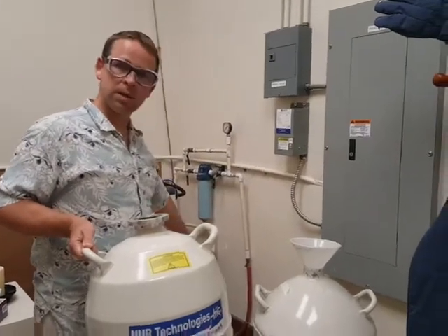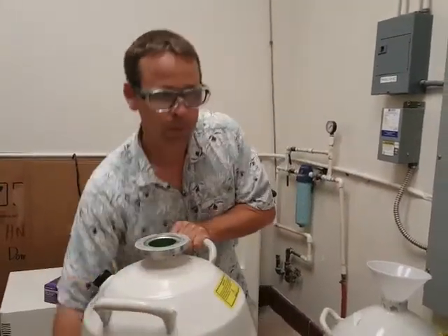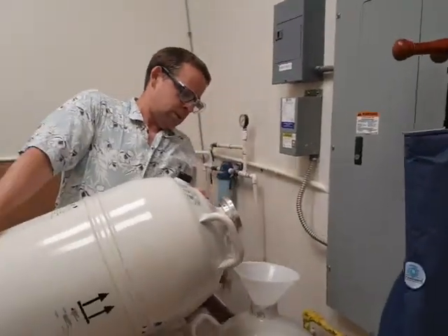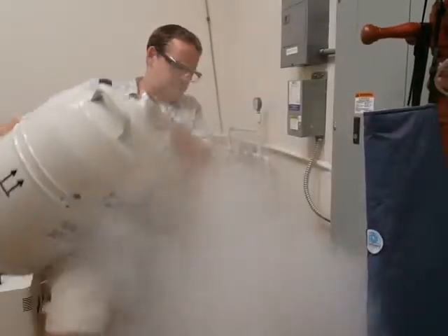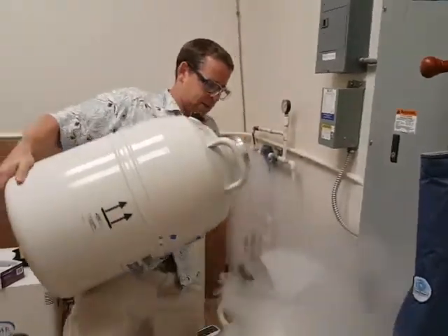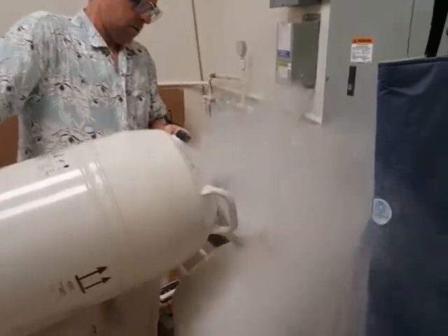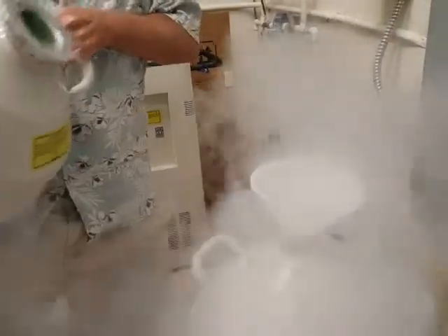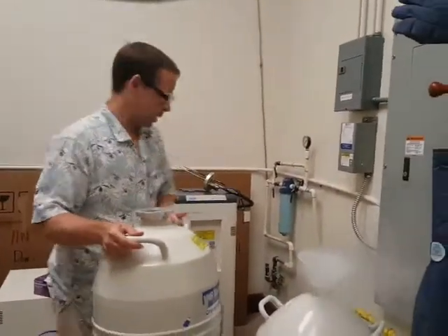Anything out of here that's in this corner — the one that I have right here — you're welcome to take. I've found it easiest to dump it into one of the ice buckets. I'm going to put my knee up here to give me a little bit of height. I won't take the time to go any further — you get the idea, this is where your liquid nitrogen is going to be coming from.